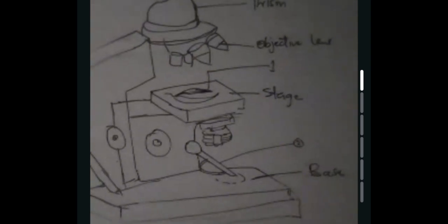This is the stage. No, it is the base. The stage should be here. So now, this is the stage. Now, what is this? It's a clip. So what is it? Who's going to tell me what this is? I'm labeling it as number 1. Who's going to tell me what this is? I'm labeling it as number 2. Okay, who's going to tell me what number 1 is?